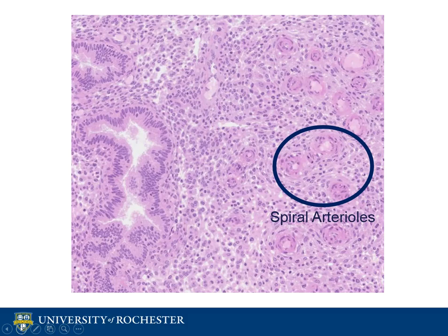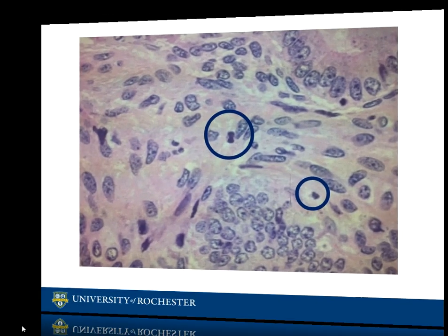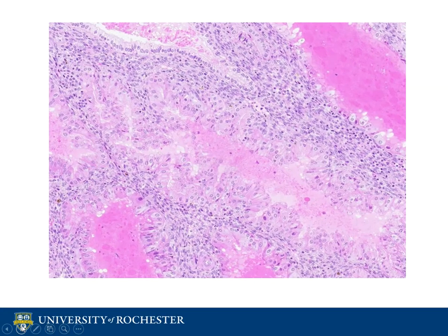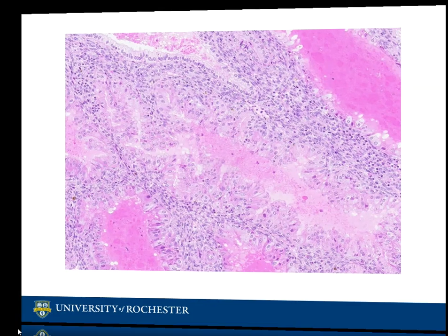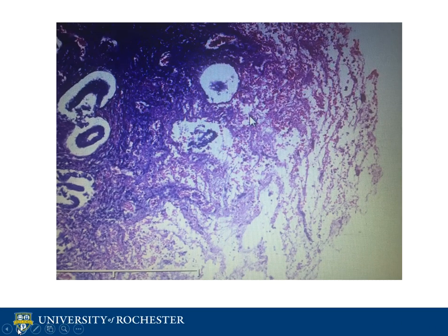In comparison, the menstrual phase has abundant blood, which appears as these bright magenta areas. During this time, the functionalis layer of the uterine endometrium is shed off. This can be seen as tissue in this area which appears to be deteriorating and thin.